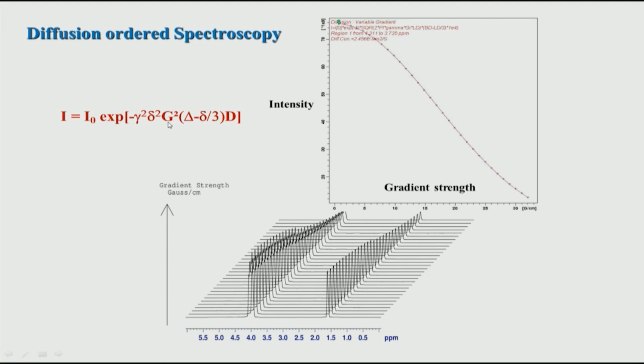So, if you want to rephase, you have to undo it, and undoing will work only if the diffusion has not taken place at all. But the moment diffusion is there, even a small diffusion will not allow you to undo or reverse the phasing of the signals which have got dephased. So, the stronger the gradient, the harder it is to rephase the signal which has got dephased.